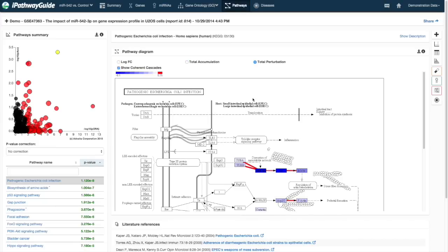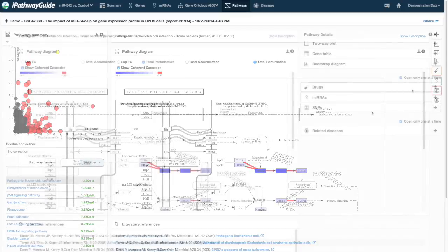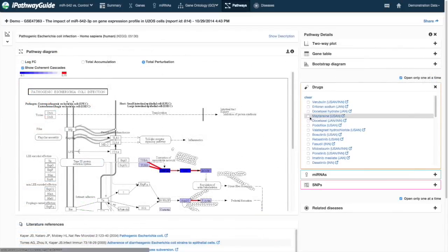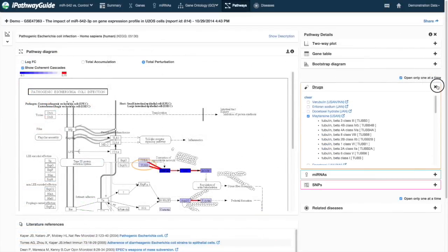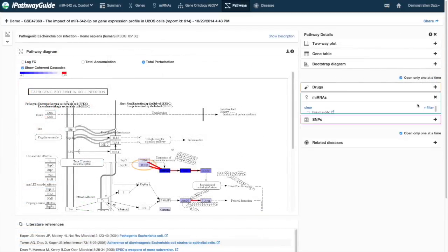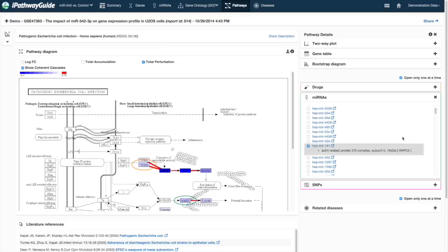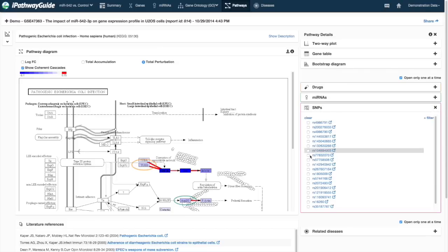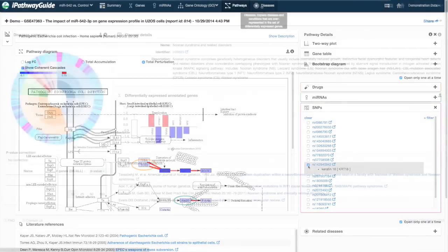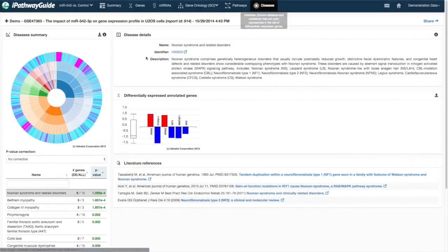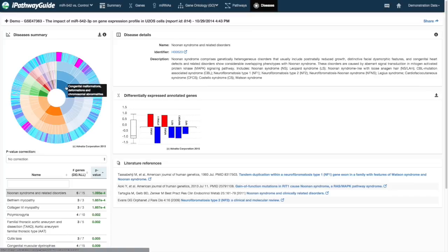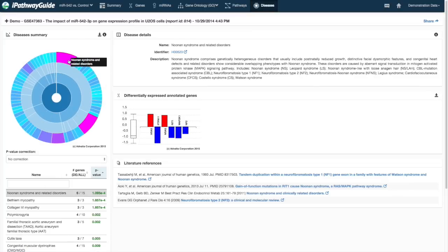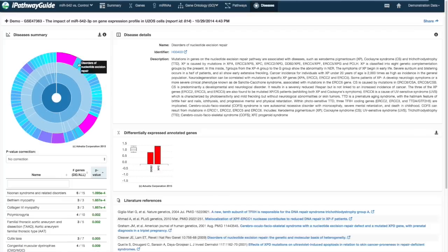The ability to model targets for drugs, microRNAs, and variants directly on the pathway is one of the unique features offered in iPathwayGuide. You can also easily identify diseases and disease categories with enriched annotated genes.